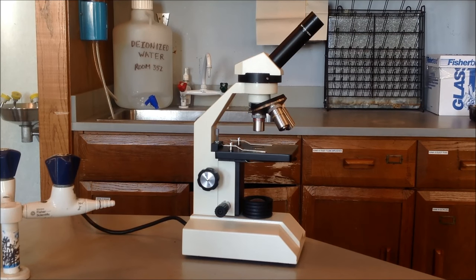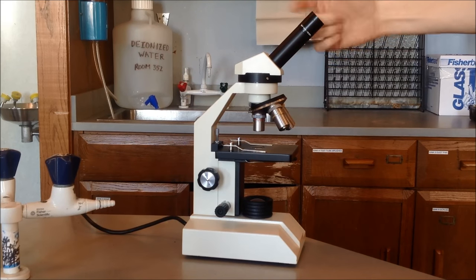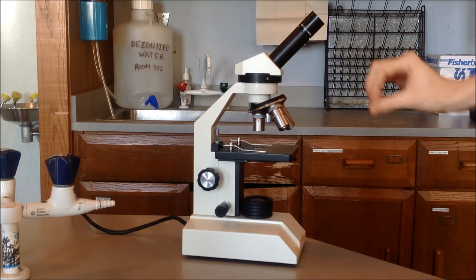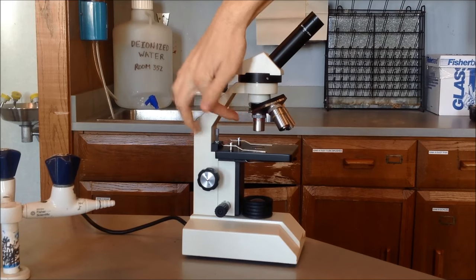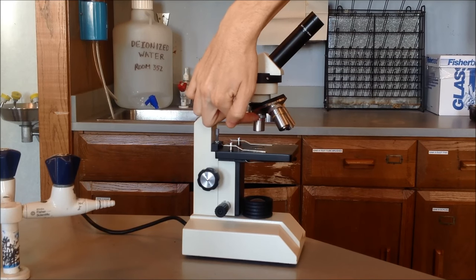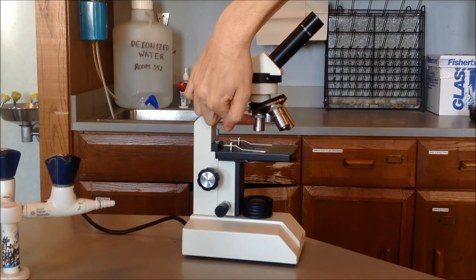So the first one on the table is the eyepiece. The eyepiece is this part. The eyepiece magnification is actually listed for you on the eyepiece. In this case, the magnification says 10 times. The next thing on there is scanning power. Scanning power is the smallest of all of the objective lenses and it's colored in this case with a red. And so that is scanning power, or that's the scanning power objective right there.